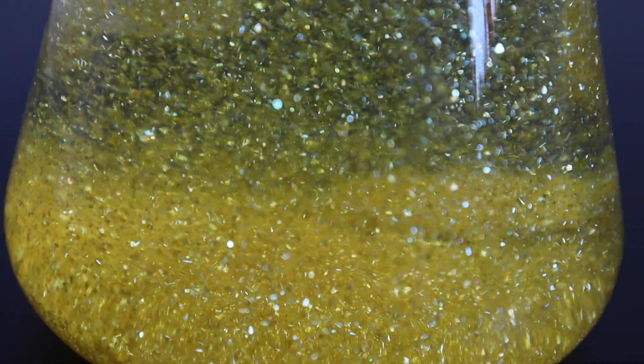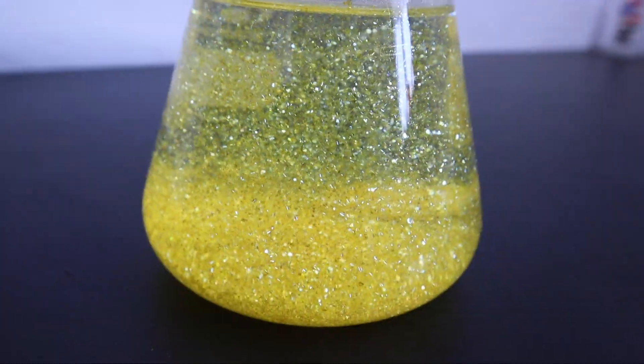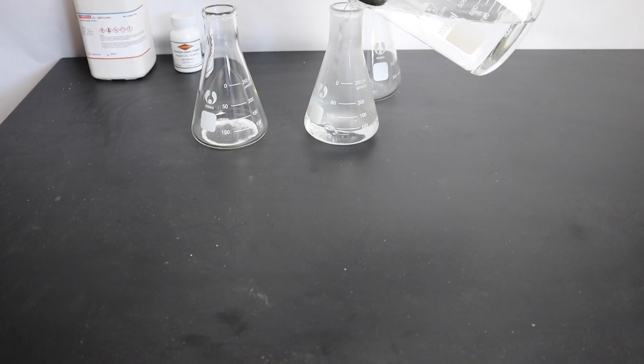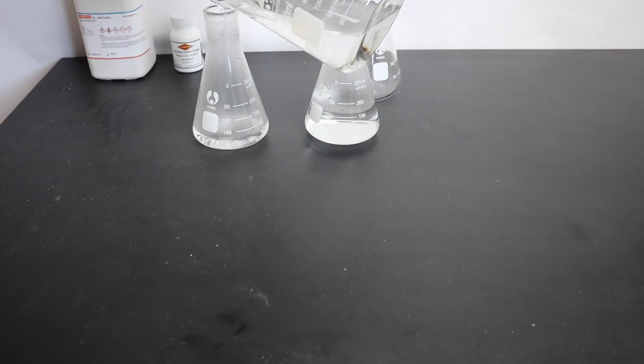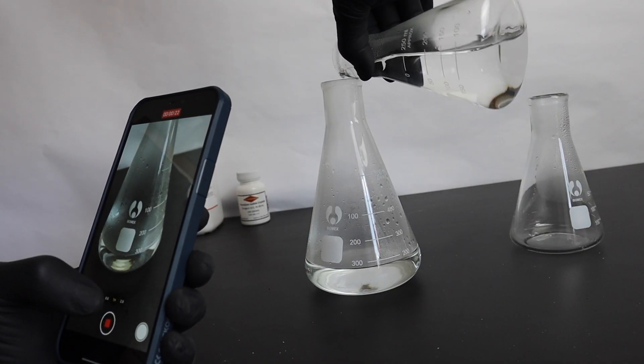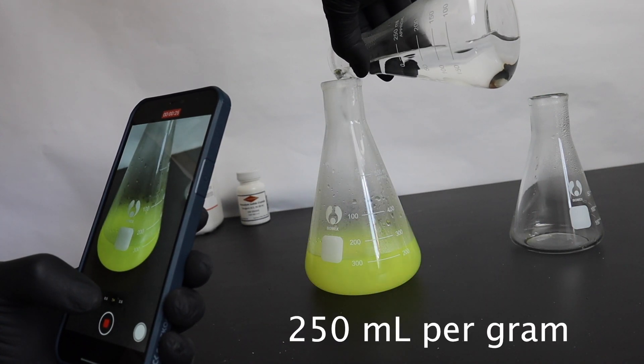In this video, I'm going to perform this simple but visually spectacular golden rain experiment. The only thing you have to do is add equal amounts of lead nitrate and potassium iodide to two separate containers, then dissolve them in near boiling water.